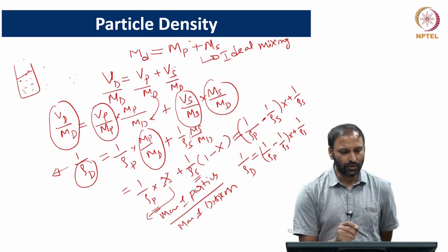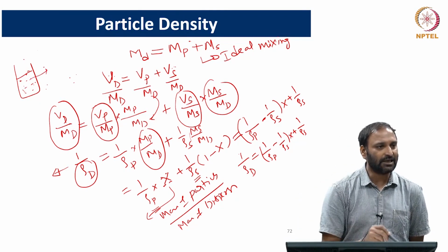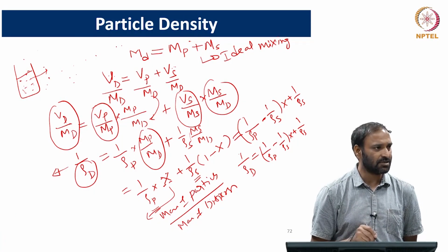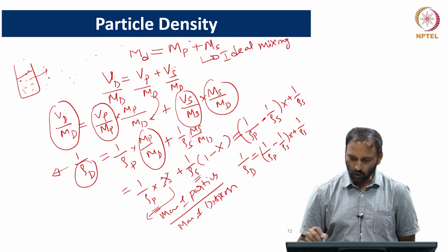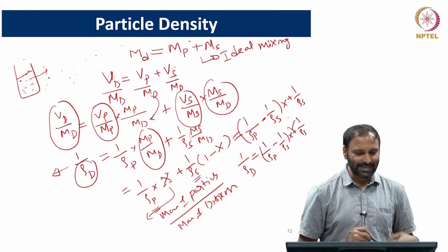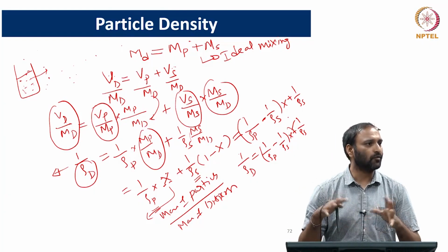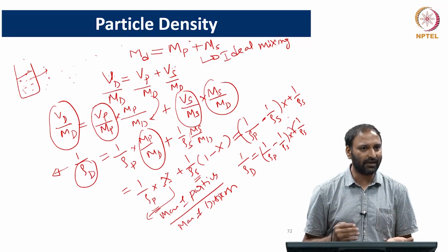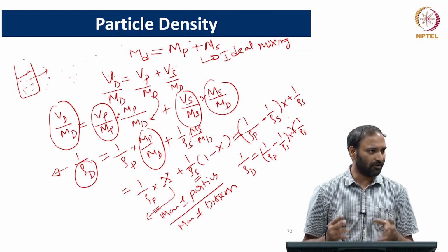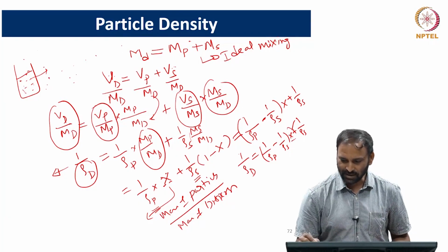Okay. Now we will go back to the experiment that we were discussing. I am going to prepare a series of dispersions in which I know the mass fraction of particles. And it is easy to find the mass fraction. I take a dispersion and evaporate all the fluid and get the mass of the particles in the dispersion, just by evaporating all the fluid and measuring the mass. Therefore, the difference in the weights is going to give me x.